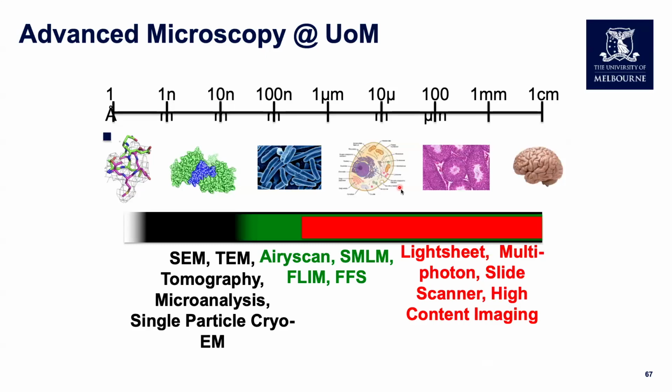Okay, so things have gone a bit strange. We've gone through quite a lot of different applications here through the kind of fluorescence microscopy. So from large samples all the way down past the diffraction limit into super resolution microscopy. As I say, we won't touch on any of the electron microscopy applications, but if you have any interest there, then let me know and I can put you in contact with the facility manager of our electron microscopy core.